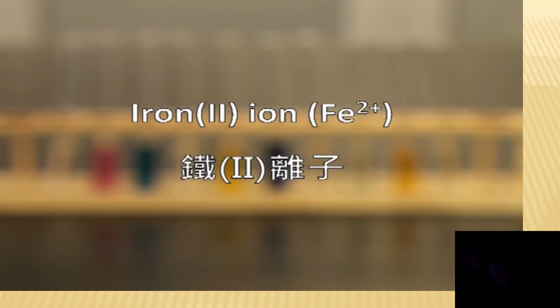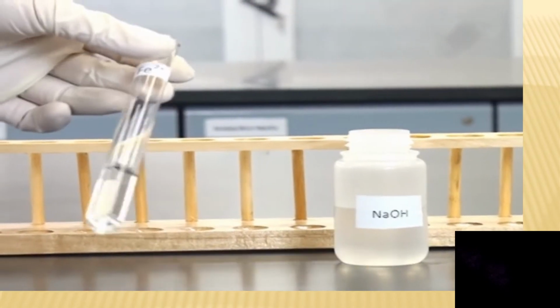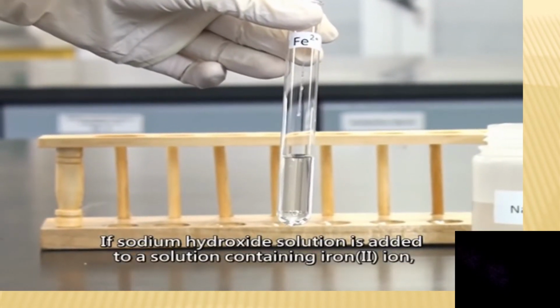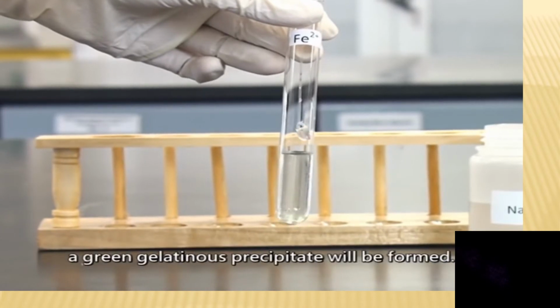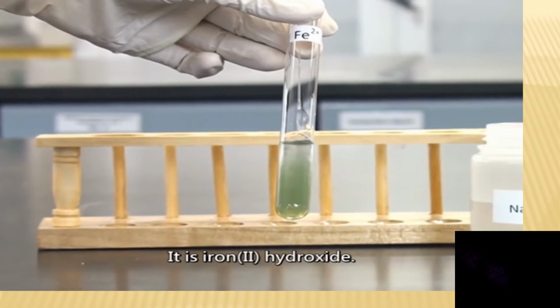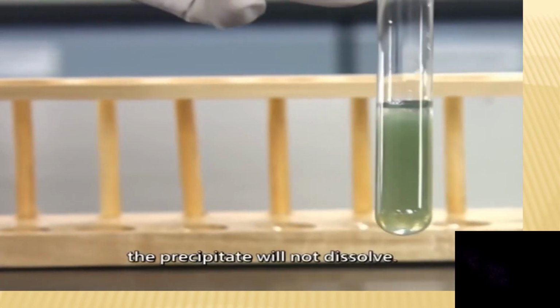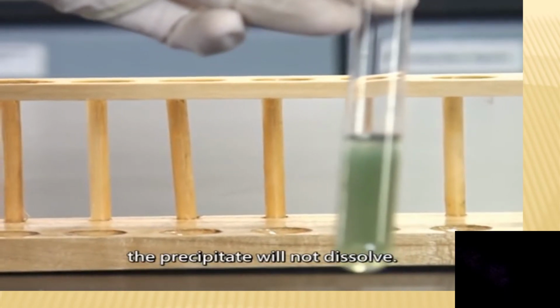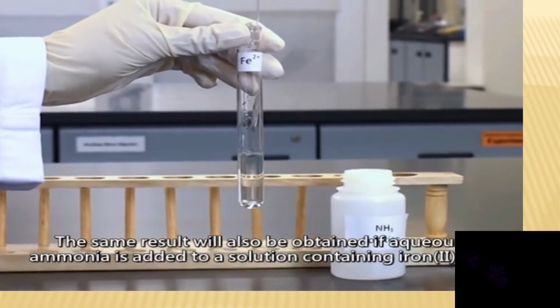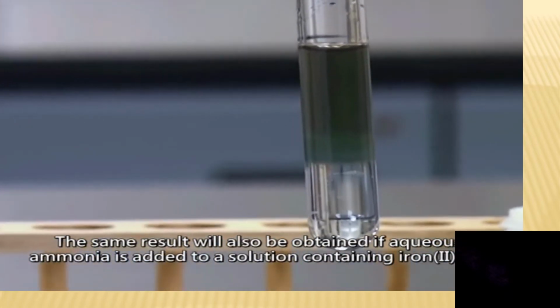Iron 2 ion. Iron 2 ion is a pale green ion. If sodium hydroxide solution is added to a solution containing iron 2 ion, a green gelatinous precipitate will be formed. It is iron 2 hydroxide. If excess alkaline solution is added, the precipitate will not dissolve. The same result will also be obtained if aqueous ammonia solution is added to a solution containing iron 2 ion.